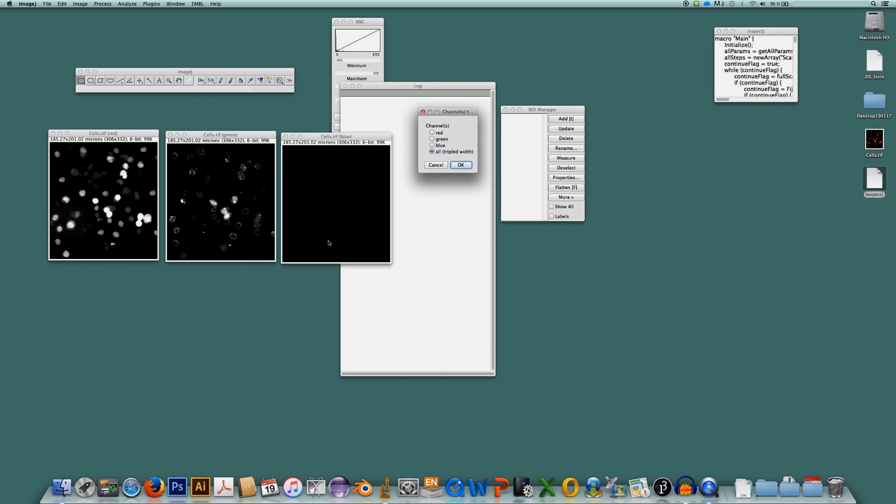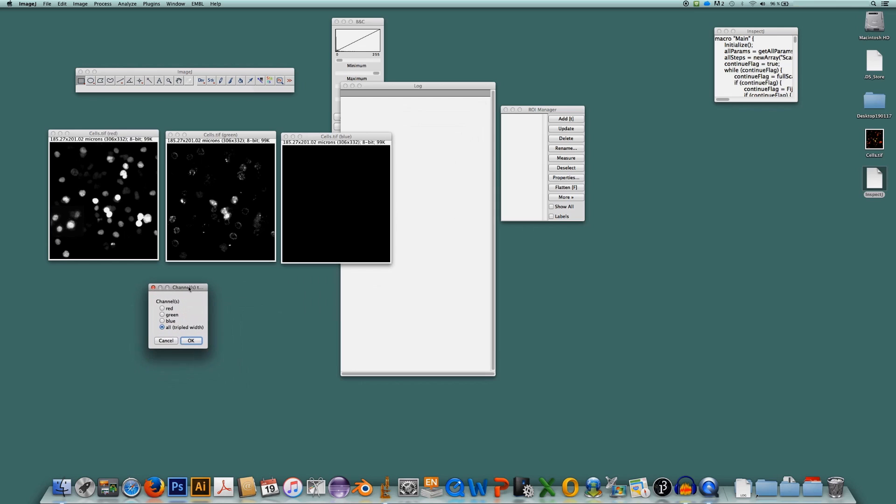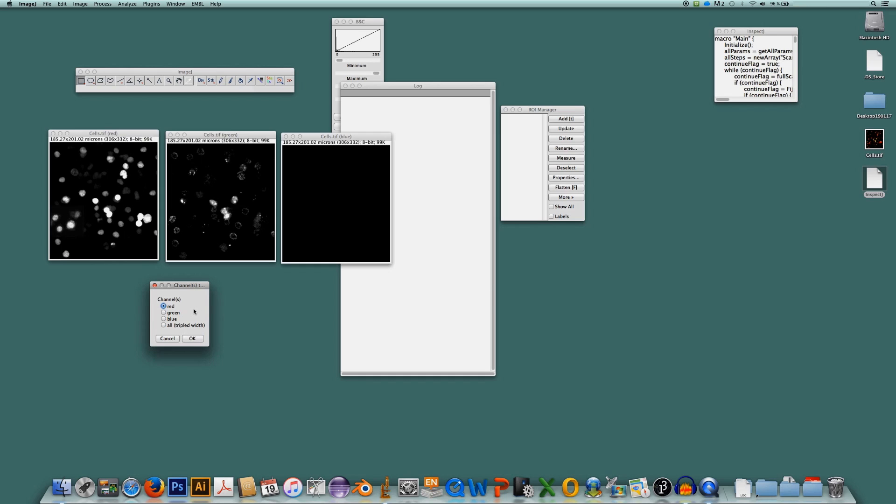The user can now decide whether to analyze only the red channel or only the green channel or only the blue channel and it can be selected here in this window. So you can check for red, green or blue or for all three channels at once. Here I will analyze only the red channel. So I check red here and I click OK.